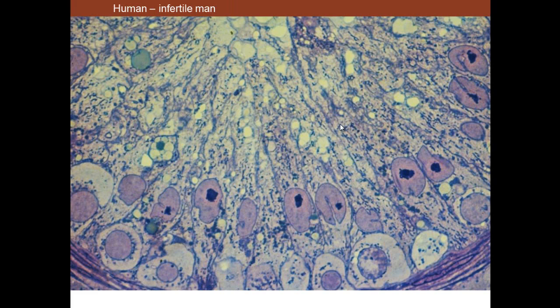If we look at the infertile man, we can get a view of the Sertoli cells because they only have few germ cells. These are spermatogonia at the base. And then these are the Sertoli cell nuclei. Characteristic of Sertoli cells is a big nucleolus. It also has an indented nuclear envelope. You can see the indentations. And it has a euchromatic nucleus.